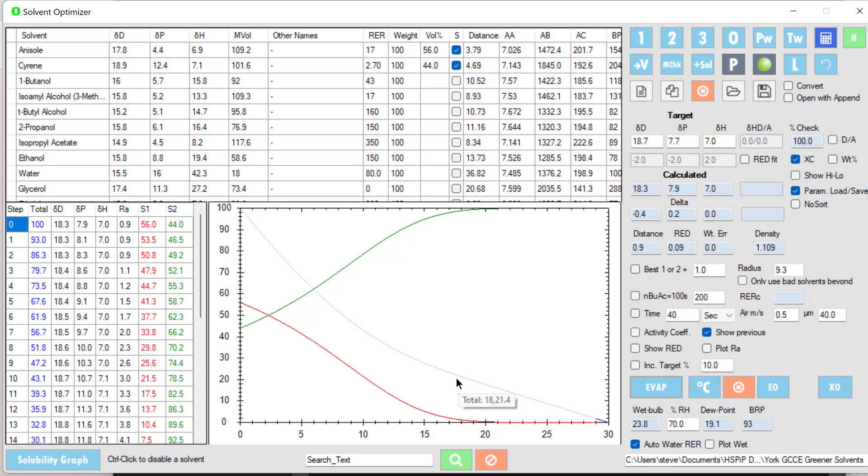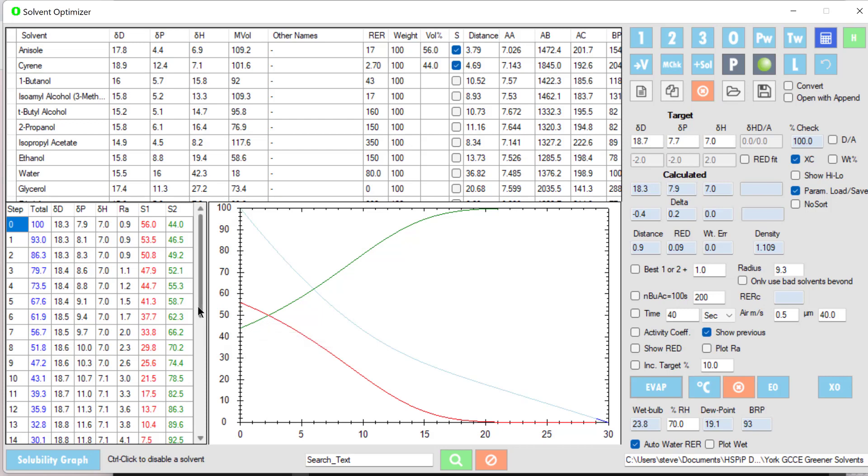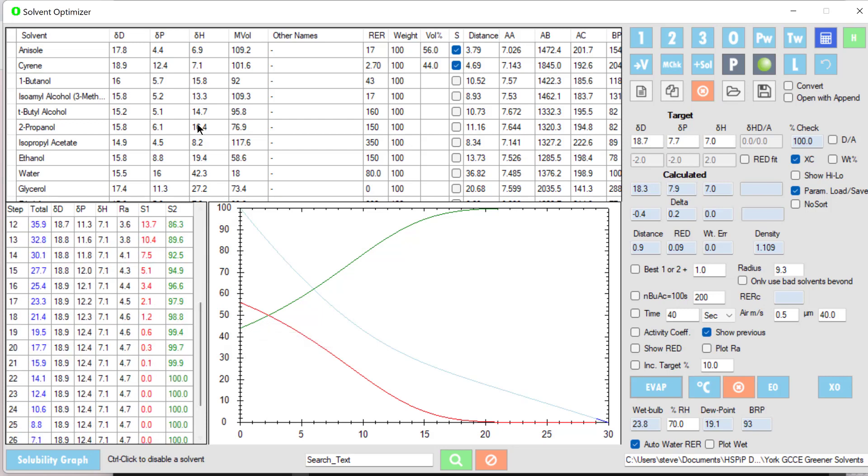This might not be the best way to do things. We start off with a really good solvent blend where the RA, the distance between the blend and the polymer, is very low, which is great. But over time, because the anisole has disappeared, we end up with a larger RA, the 4.7 of the cyrene.